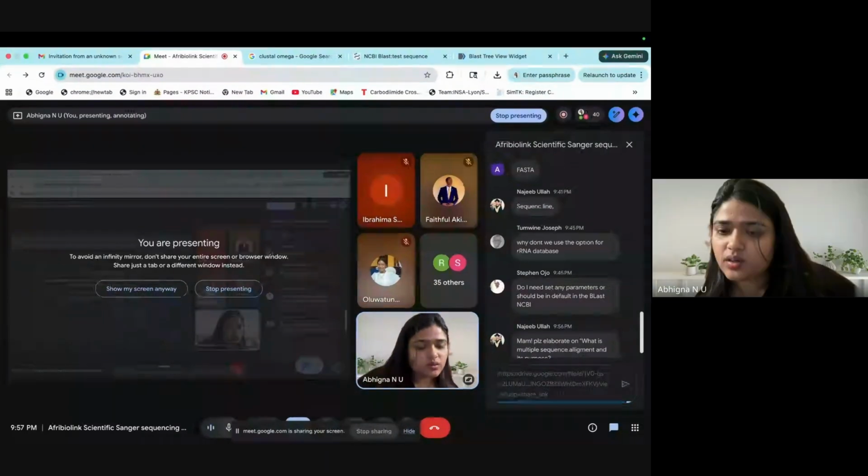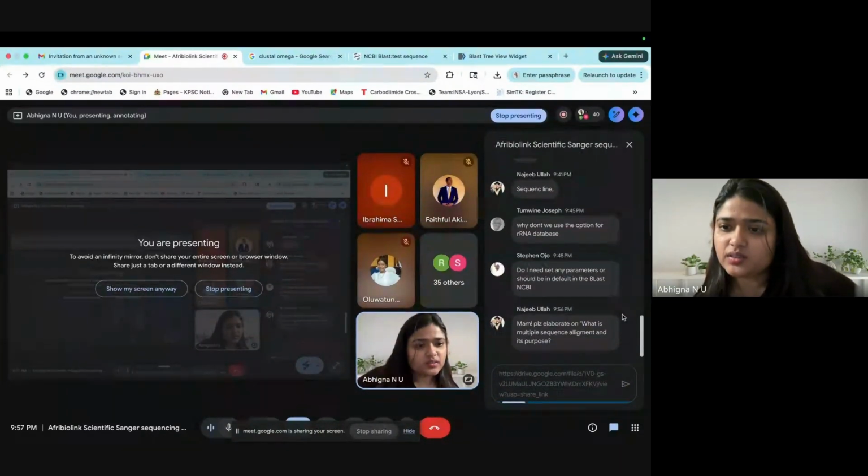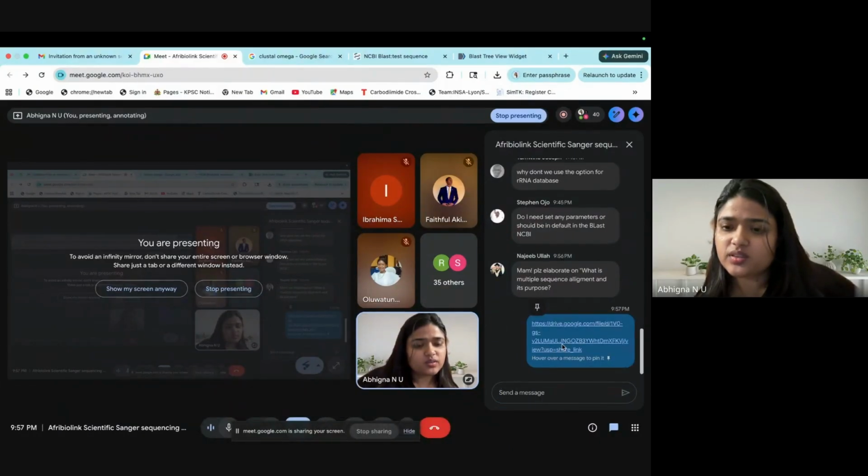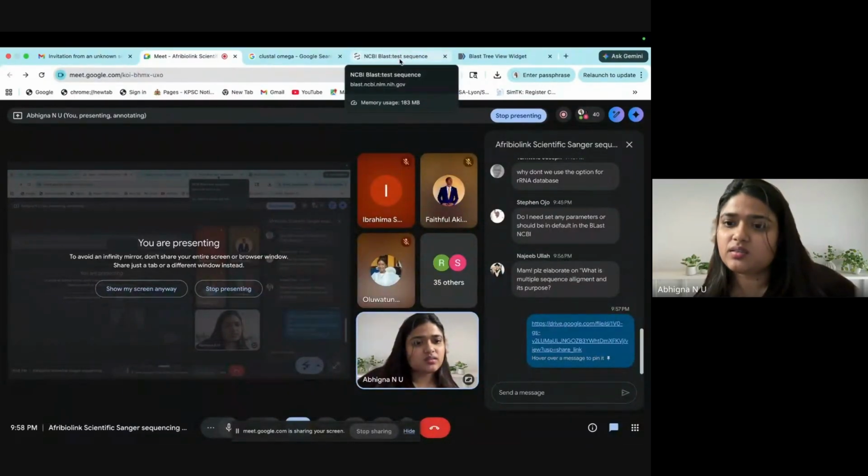I am giving you all a link. Please download the sequence and perform the NCBI blast, and then we'll go for your questions.